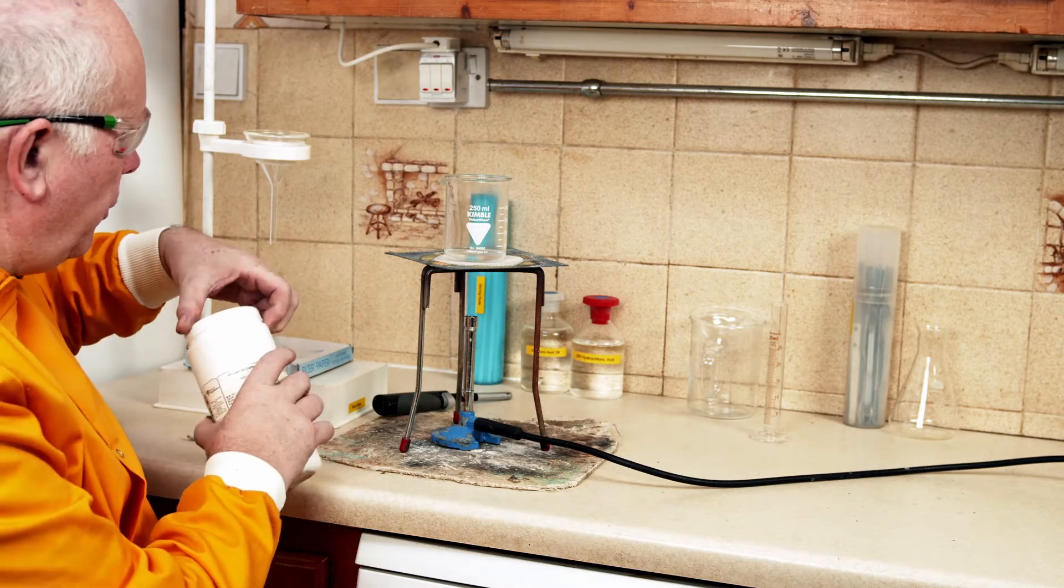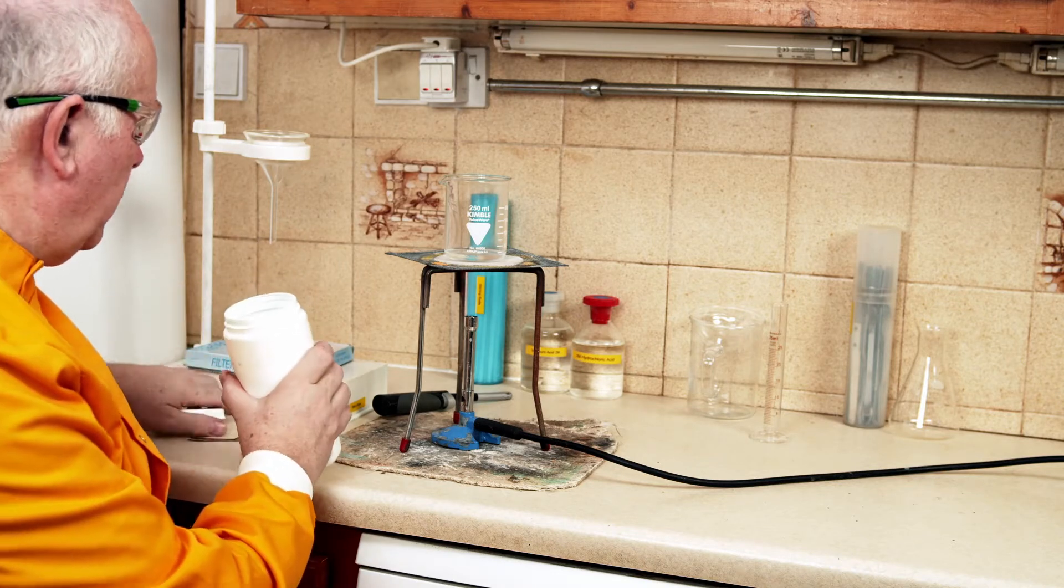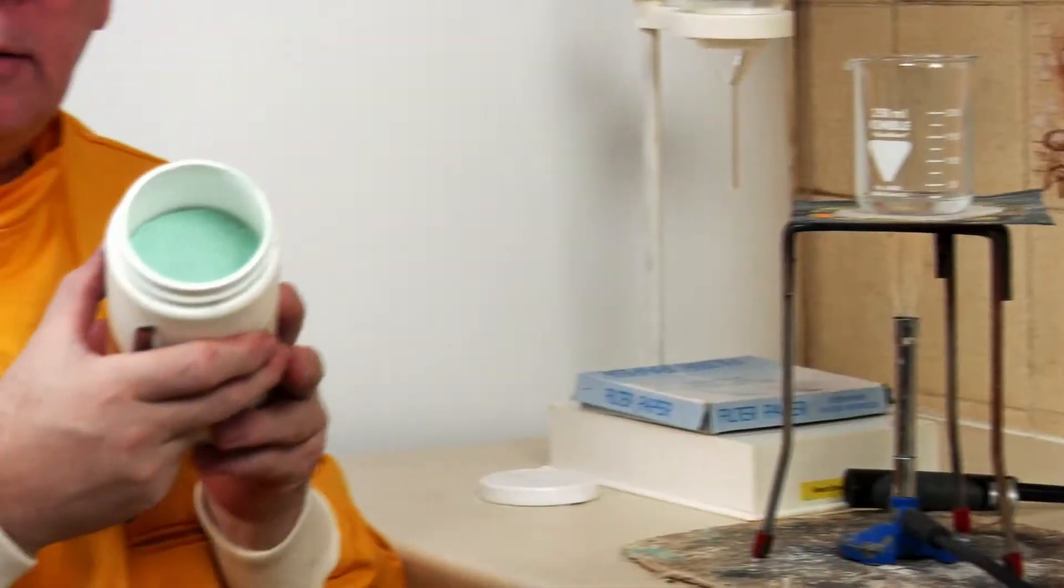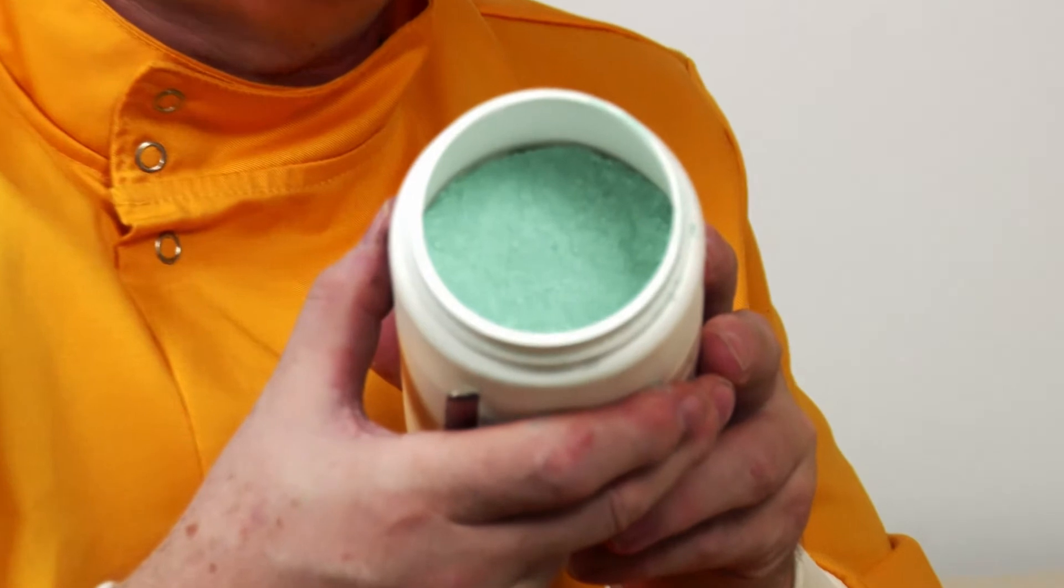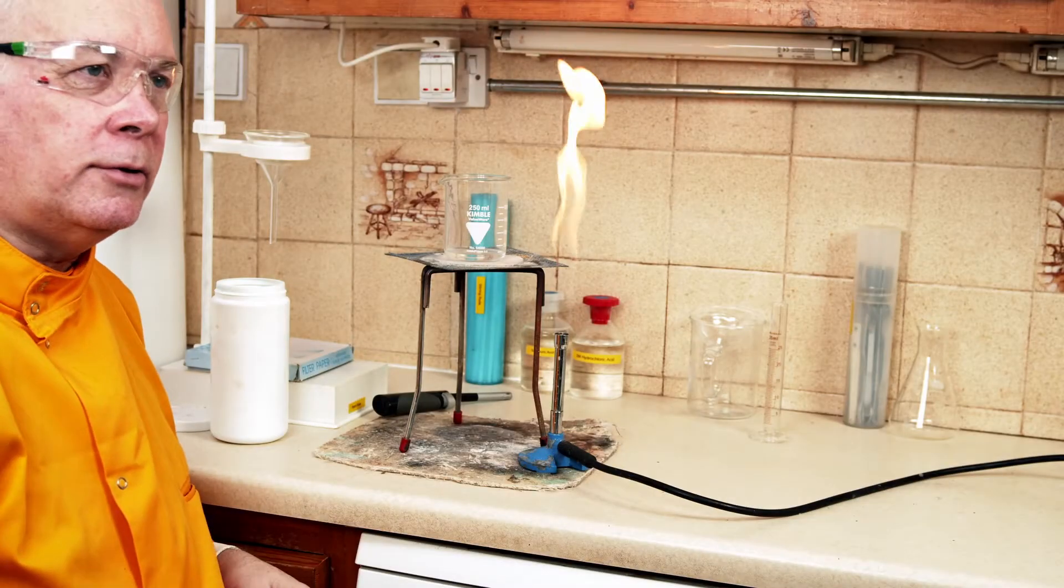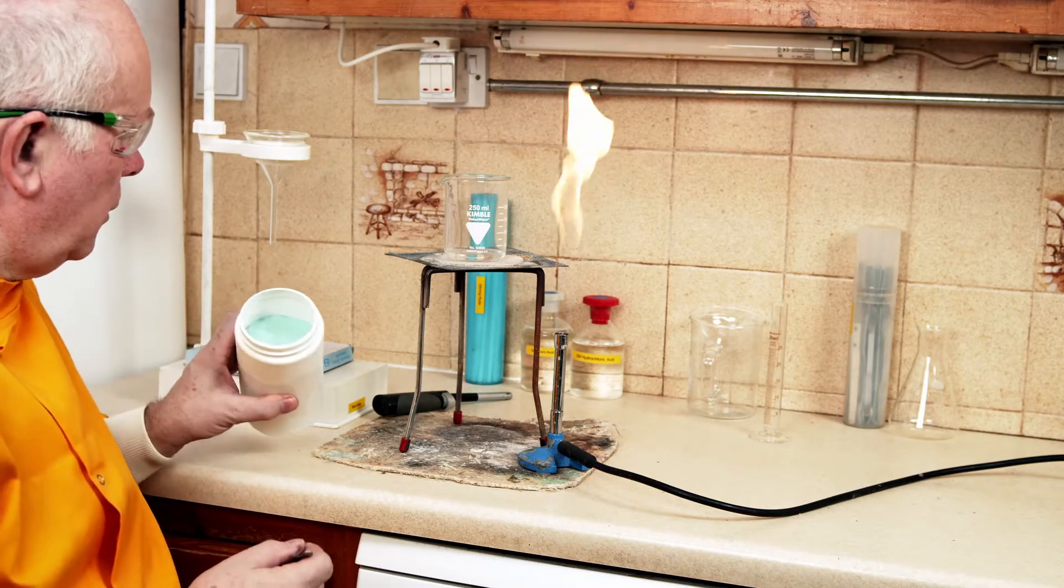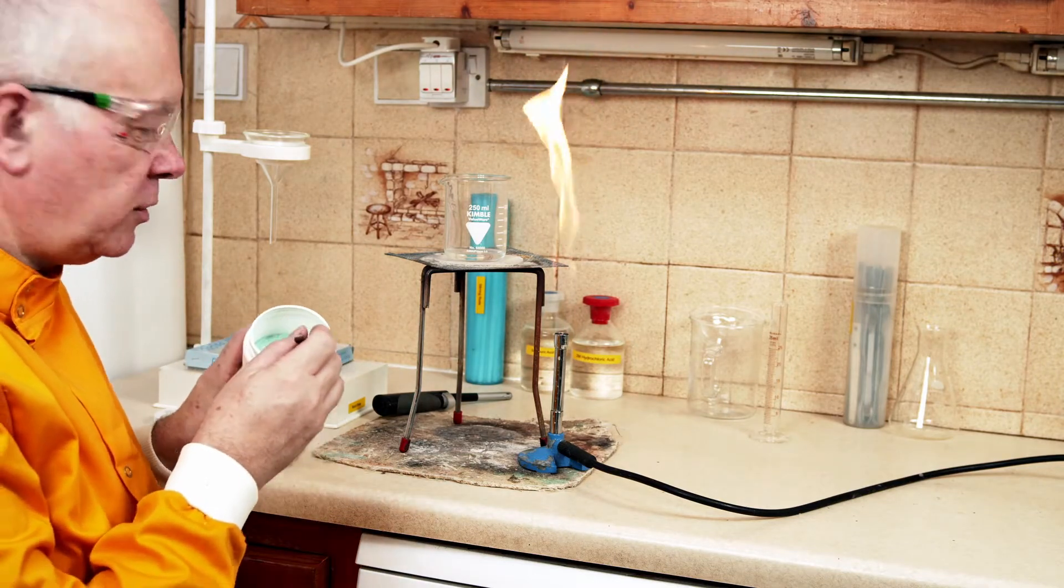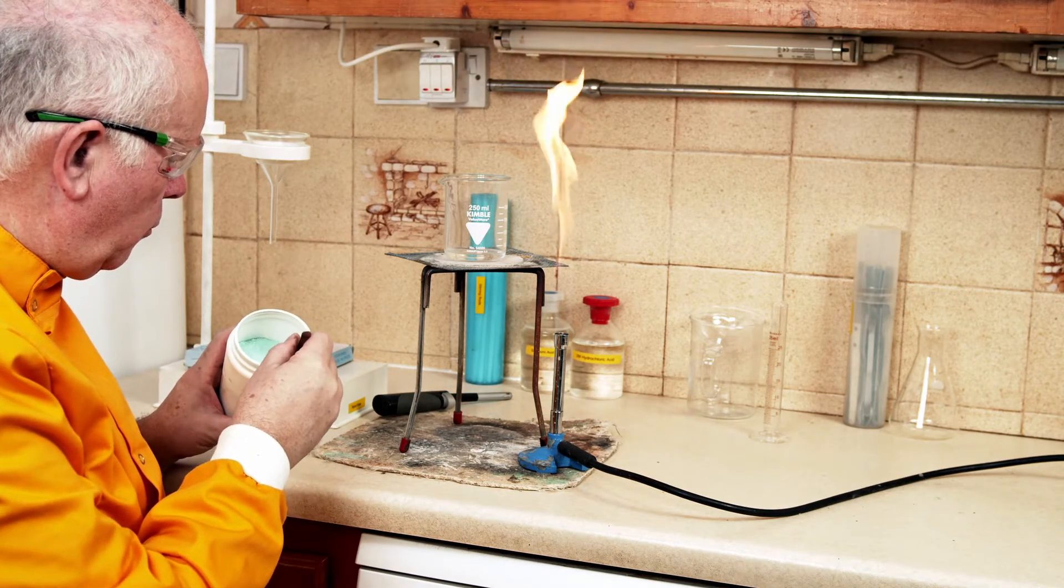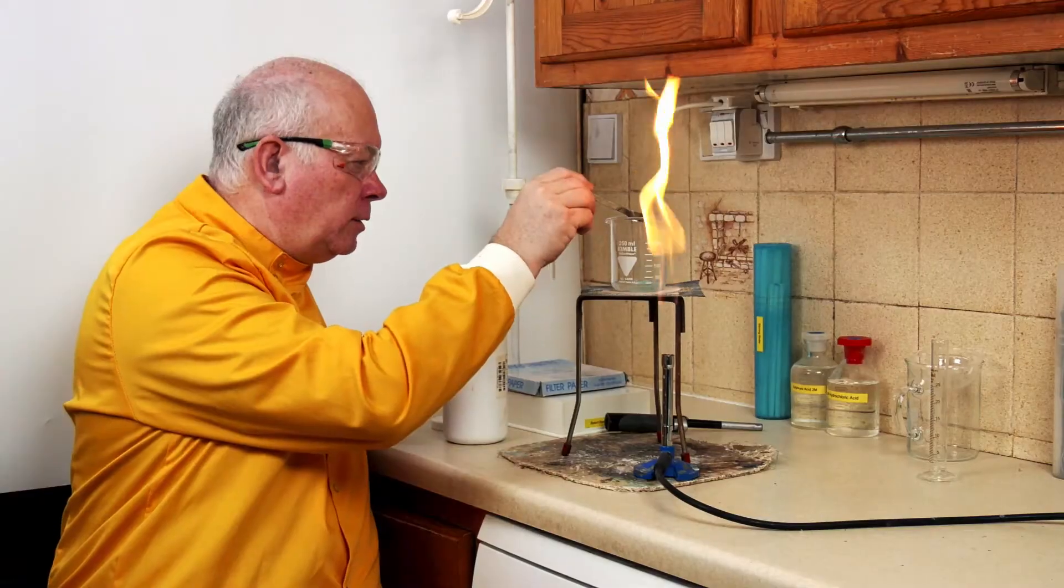Now I'm going to put in the copper carbonate a little bit at a time. Now this is a beautiful color substance, this sort of green color. When we add this to an acid we're going to produce carbon dioxide and water. So let's just add a small amount here to the acid.